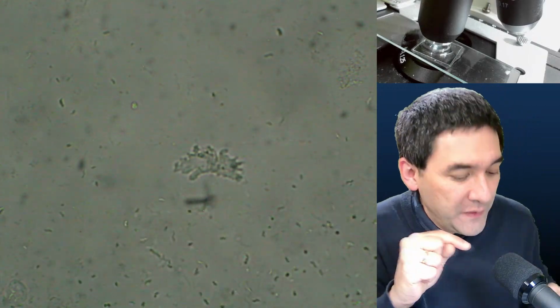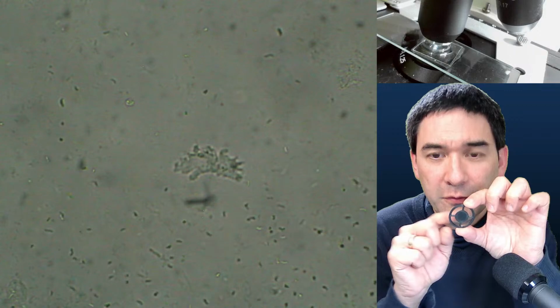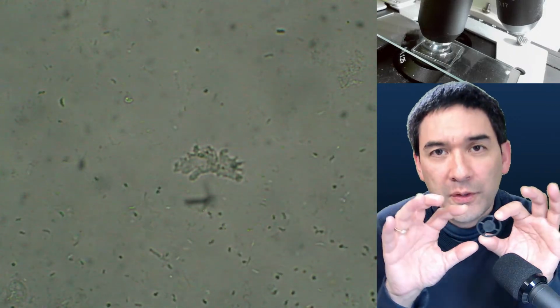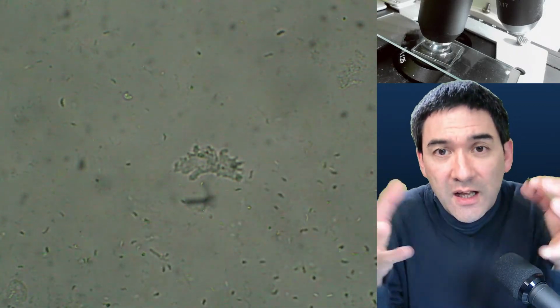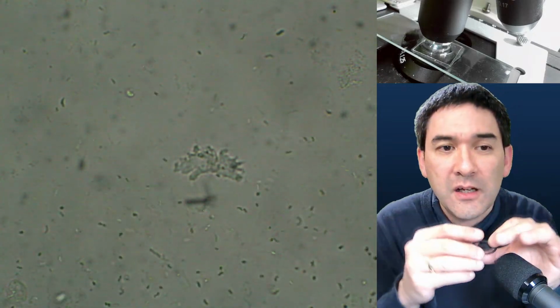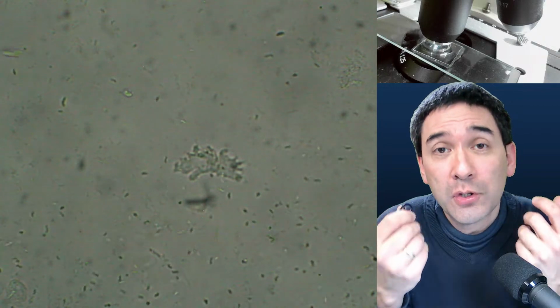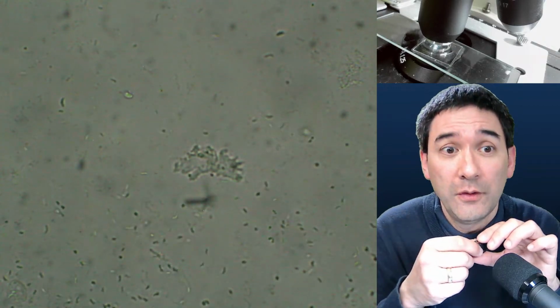What we're doing here with the patch stops is we're blocking out the light from the center, so we're losing light. But with those special dark field condensers which have this curved mirror system on the inside, the light is simply redirected. So you're getting, also at higher magnifications, much more brightness of the image.